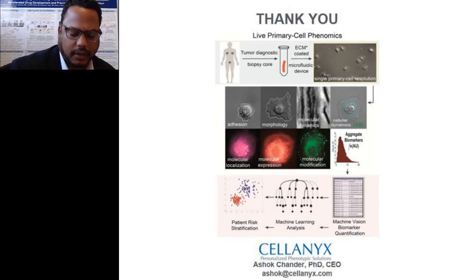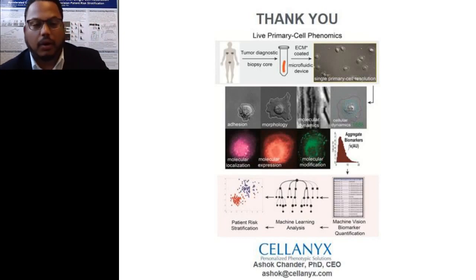roughly, and then the analysis can take anywhere between 5 to 10 hours, depending on what one might want to measure. And then the data analysis can be condensed to 1 hour, depending on computing power.